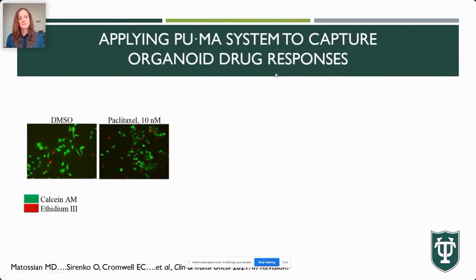We used this technology. At the time, we were finishing a paper on how to characterize that aggressive PDX model that I mentioned, 4IC. And what we had done was we had taken the primary cells that we had generated, we treated the adherent cells with paclitaxel since the patient's tumor was resistant to a taxane therapy, and we hit with physiologic doses of paclitaxel. We did find that there was a very minimal response of the adherent cells.